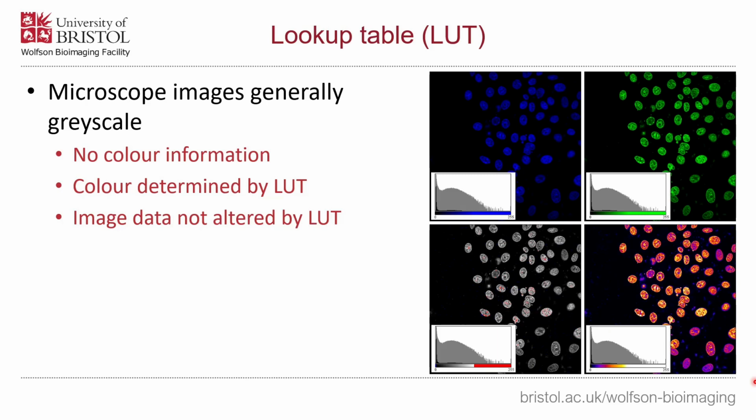Also worth noting that, again, image data isn't being adjusted by anything when you set the lookup table. This is literally just ImageJ's way of displaying it onto the screen.